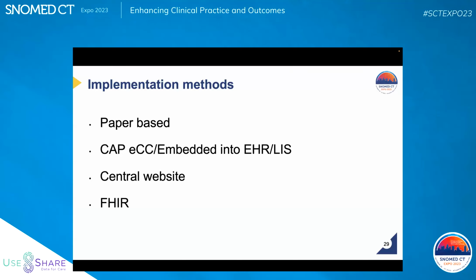Okay. Then there's the Dutch approach, which is very chintzy. This is tacaño in Spanish, very cheap. That fits the Dutch, but very efficient. Central website. They did a fabulous job. Within the electronic health record systems in the Netherlands, when the pathologist is ready to call the case, they hit a link. It opens up the PALGA registry website, and there's the synoptic report. It's highly dynamic. There's conditional logic, so the pathologist does not have to answer questions that are irrelevant.